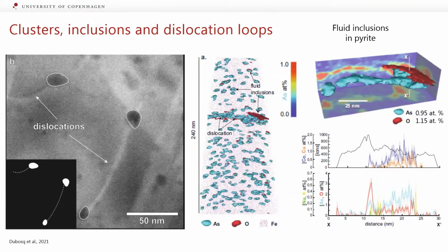And we can then go on and do different measurements as well. So you can measure the concentration in these profiles. You can create a 1D concentration profile as they've done here. But this nicely shows to what extent you can actually image and what kind of images you can create.